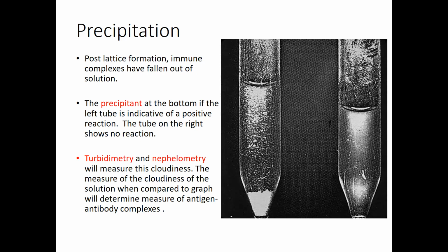So if you think about it, again using an analogy of a flashlight, if you're shining the light through a very gauzy and light curtain, a lot of light passes through it, right? We would assume that could be analogous to just a little haze or a slightly turbid solution.